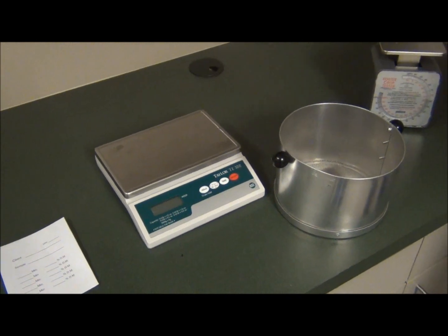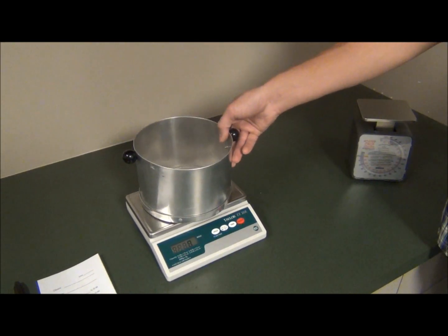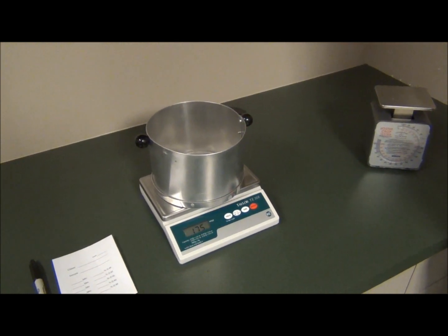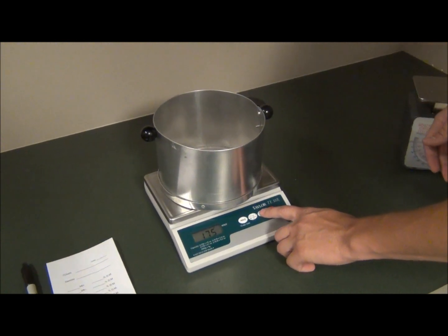Tools needed for this process will be the COSTER tester evaporation unit, a data log sheet for recording weight increments in time, a COSTER specimen container, and a scale for weighing the product — either a digital or mechanical scale are sufficient.